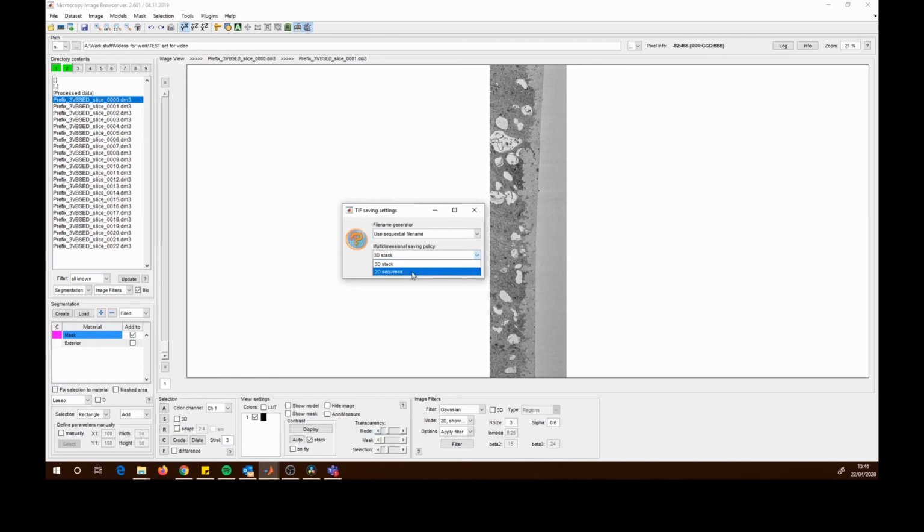You can do 2D sequences if you want. However, this could lose the Z size if you do it as 2D. What you have to do instead, if you save your data as a 2D sequence of files, is load up the entire sequence. You can't have any more or less images. What MIB does is it encodes the physical Z height of the bounding box into the image, then divides that physical height by the number of slices to get you the individual slice thickness.